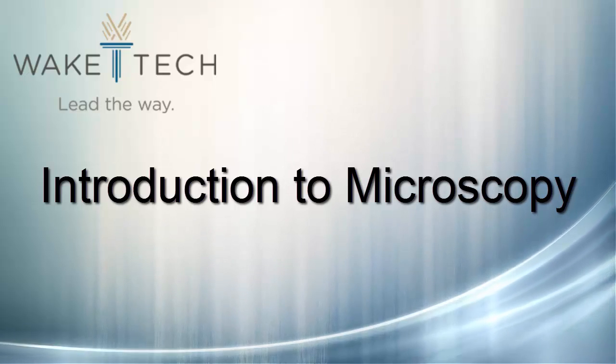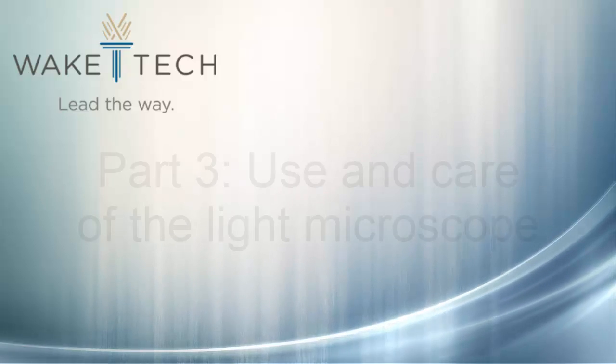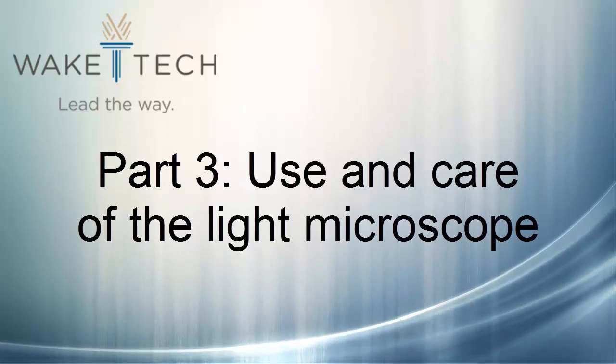Now that you know the major parts of the light microscope, you'll need to learn the correct use and care of the microscope before getting started on your lab activities.